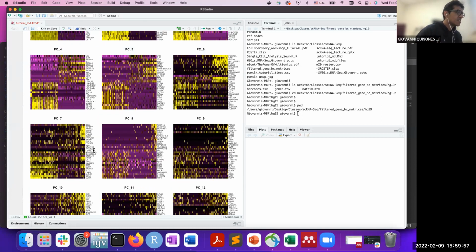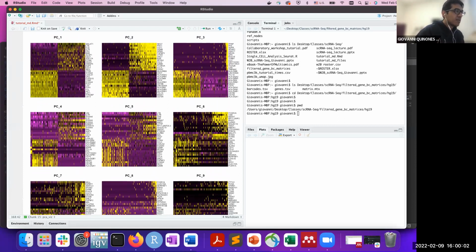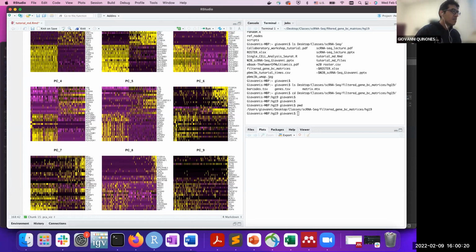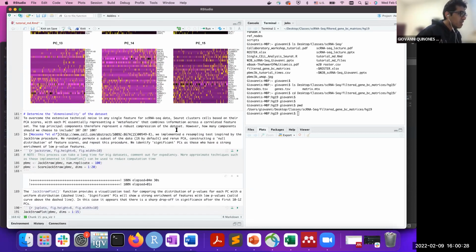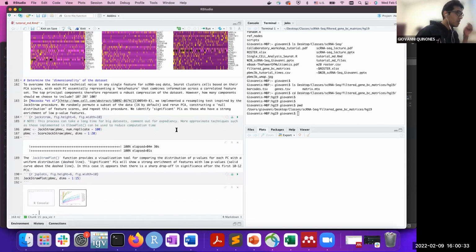From this analysis, you can see that just eyeballing it, somewhere between PC5, maybe up, or maybe PC6 even, we can still tell there is some separation. There is still some information about these genes. So maybe 6 dimensions will be good to keep, but this is our visual estimate. And there are better ways to come up with a more meaningful number.